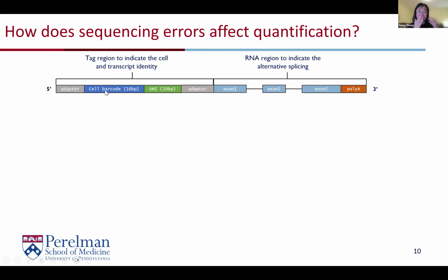Lots of people use very simple scripts to extract the UMI and cell barcode, and other groups have worked on this problem. Once you have extracted the UMI and cell barcode, you can just plug your data into a bulk-level tool. One of my goals is to convince you that this UMI barcode is a source of distress for single cell isoform quantification, as well as a source of opportunity. I'm going to show you exactly why that is.